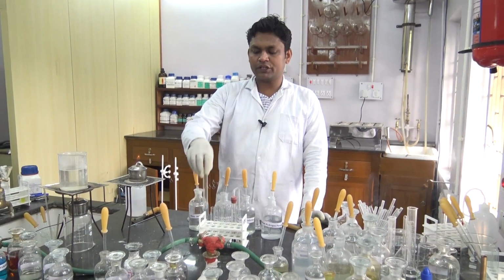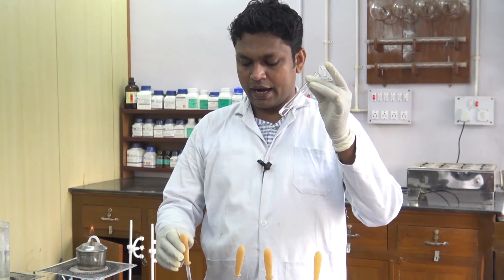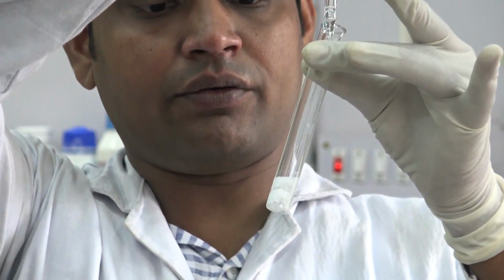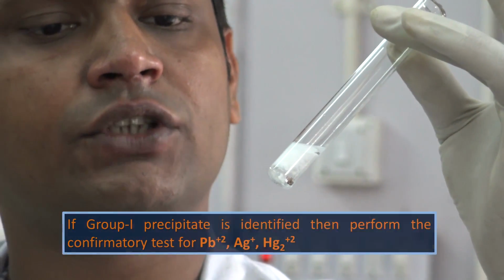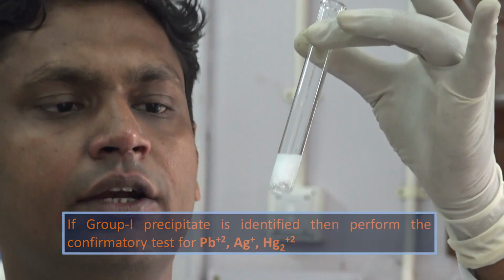First of all, test for group 1 cations. This is the test sample. Add a few drops of dilute HCl into the sample solution. If any precipitate occurs, then you have to test for lead, silver and mercurous ion. Here I have taken the lead salt.